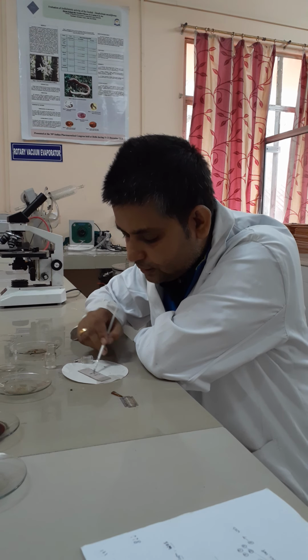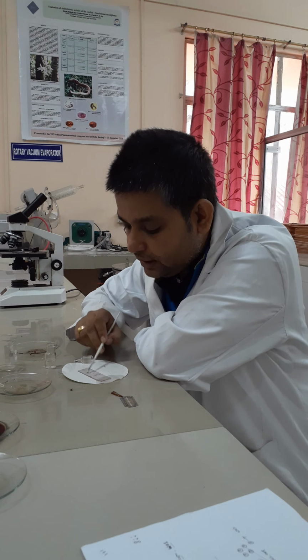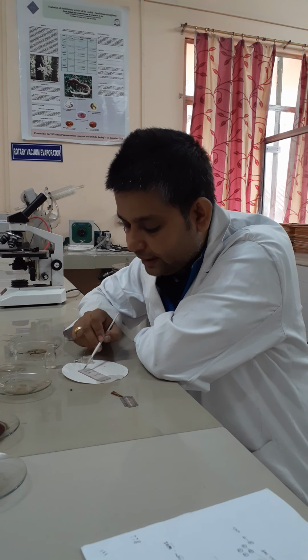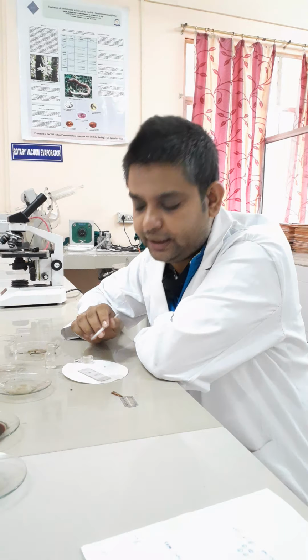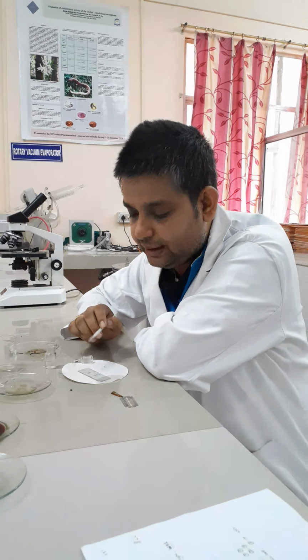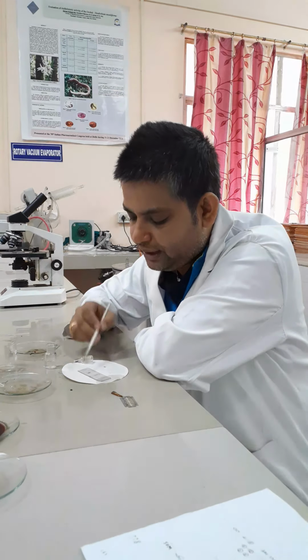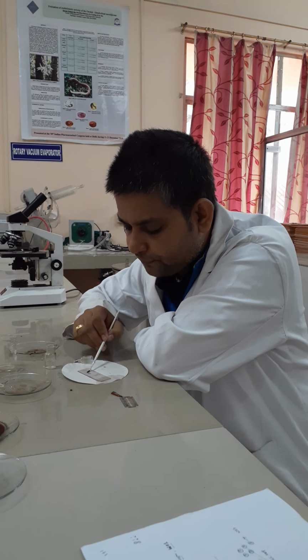Mix this with the section properly. Phloroglucinol and concentrated hydrochloric acid are used as a staining agent. This staining agent is mainly used to stain the lignin-containing cellular characters. It converts the lignin-containing cellular characters to pink color. So we have mixed it properly.